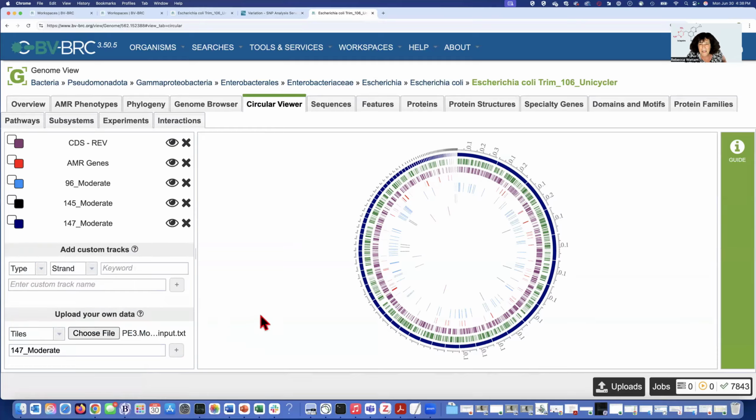You know what? I think that when you look at it this way, you don't see this so much in the genome browser. You get a hint of it when you look in the tabular view, that there are a lot of mutations in one sample versus the other. But when you see this and you know the experiment and you know they're all being treated the same way, sometimes it can give you hints of a particular sequence, that there may have been issues with the sequence. Not that the variants are bad, but I bet a lot of these are in places with very low coverage.